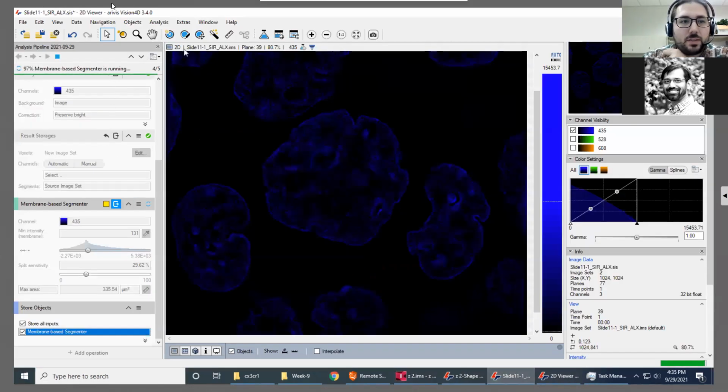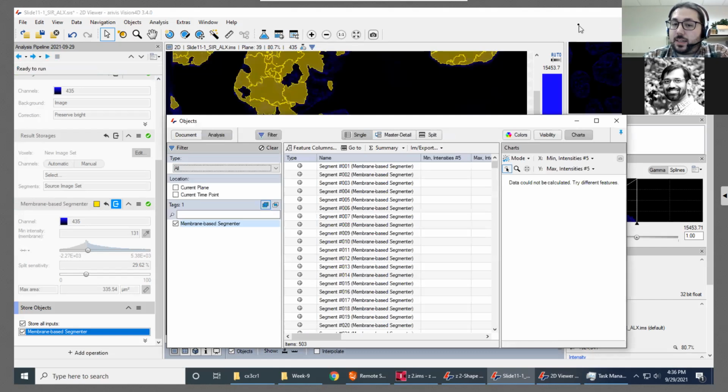Yes, that's exactly right, Gaurav. So any data you capture from one of our microscopes gets uploaded to our cloud drive. Usually it's under the letter Z for ICI Cloud. Uploading and downloading to that cloud takes time. So a large file that's over 500 megabytes, if it's a few gigs, it can take a while to download and upload. If you're trying to run the software on a file that's on the cloud drive, not only is that going to slow you down immensely, because now you're adding a lot more latency to the process.